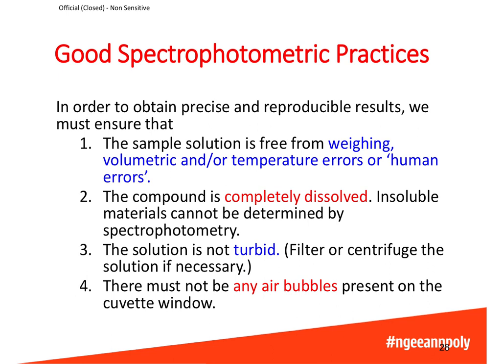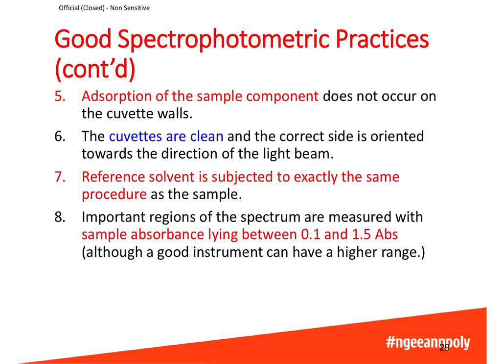or centrifuged first. There must also not be any air bubbles present on the cuvette window because the air bubbles could interfere with the transmission of light. Ideally, the sample components should also not be adsorbed onto the cuvette walls. This is because if the sample starts coming out of the solution and sticking onto the cuvette walls, the absorbance of the sample will change over time.